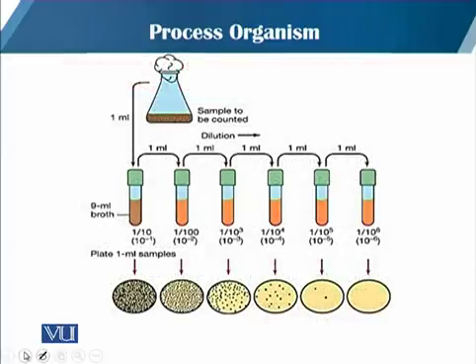As concerns how we isolate the organism, the most applied method is the dilution method. If we collect any sample, either from a hot spring, the soil or a lake, it can have a large microbial load. So in order to get isolated colonies, we first make a dilution.